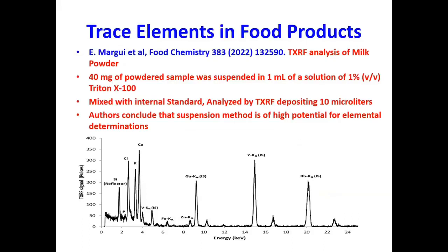Then another similar publication in the agriculture area, which I can find, is from Professor Margui's group. It is published in Food Chemistry. They used TXRF for the analysis of milk powder.